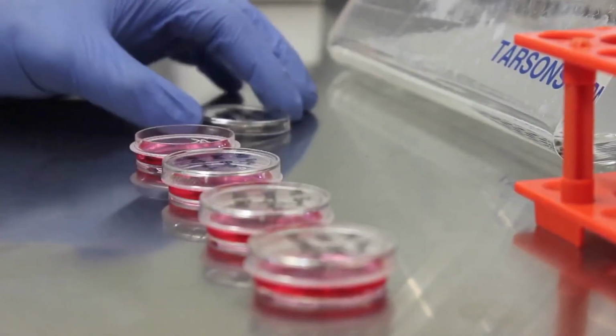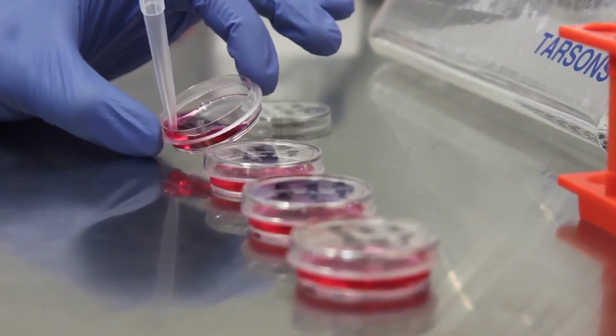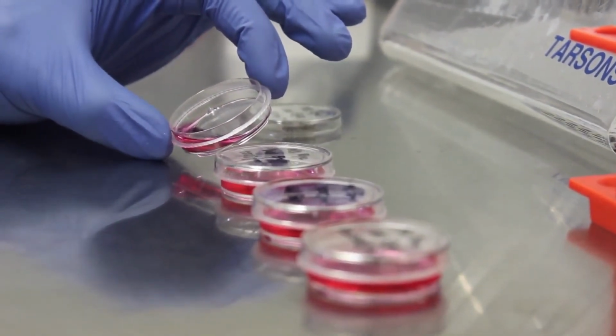Plate 0.2 million cells per 35 mm cell culture dishes. The cells were primary cells from mouse ocular surface.